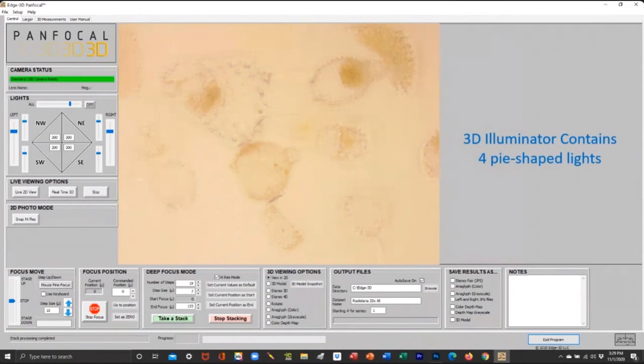If you take the lights on top, where it says all the lights, you see all the lights are on about 80% right now. And when you slide that slider to the right, it automatically turns all those other sliders up. So this is the picture of that radiolaria up a little closer using all the lights. That's equivalent to a regular standard bright field microscope.